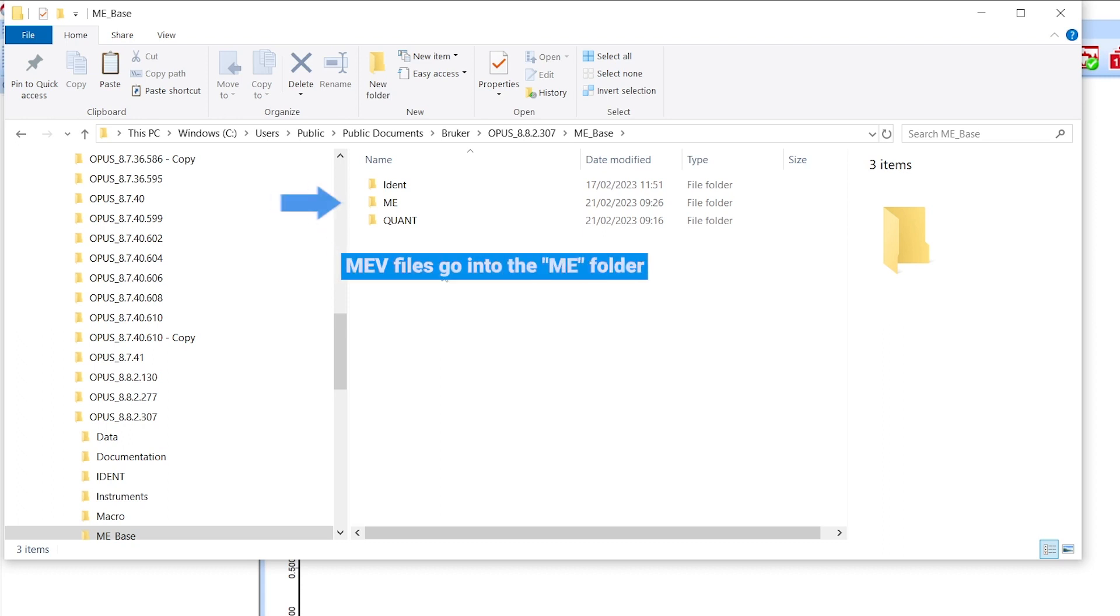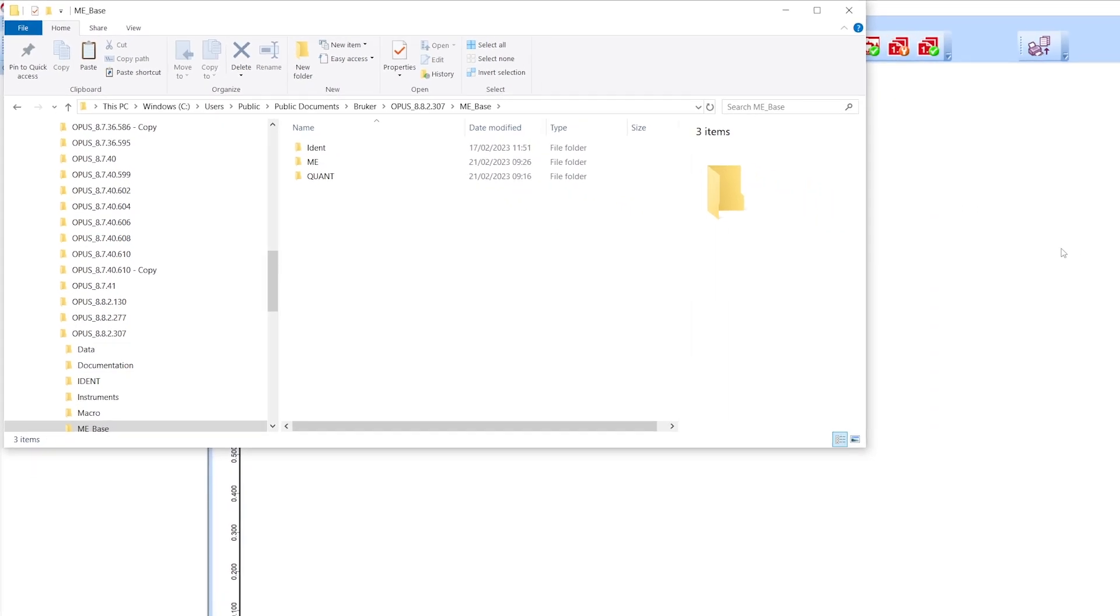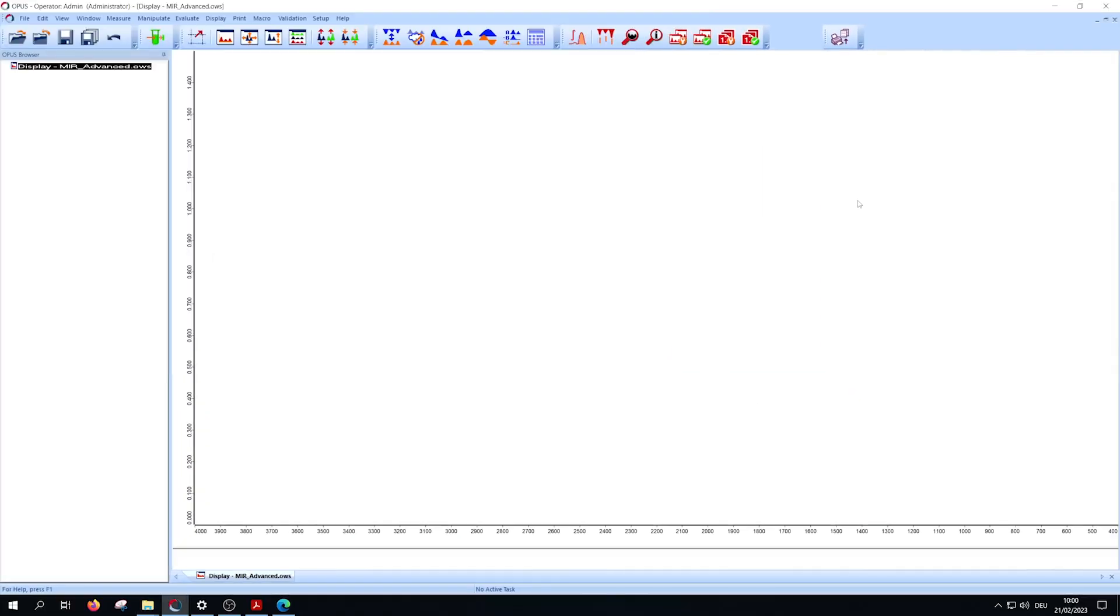The ME folder is for the MEV files. Now go back to Opus and open the MEV setup.